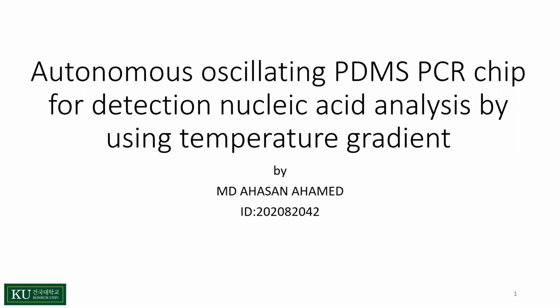I am going to present my project work, which is an autonomous oscillating PDMS PCR chip for detection of nucleic acid analysis by using temperature gradient. Actually, it is the combination of two papers. One is an oscillator, another is a PCR chip.